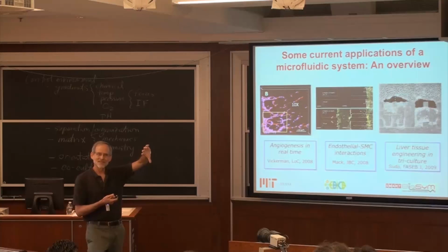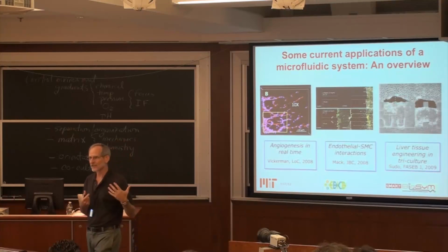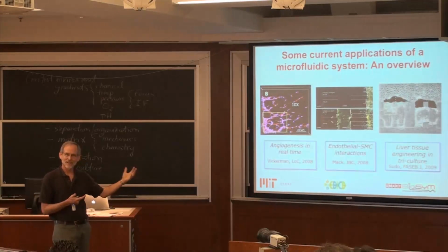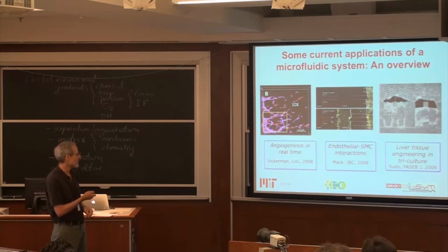What we were hoping to do is actually get these vessels to penetrate into the hepatocyte mass and start to develop something that had function more like liver. But then we looked and thought, well, during development, what happens is you have these hepatic stellate cells that are sort of the sentinels that lead the endothelial cells into the matrix, into the hepatocytes.